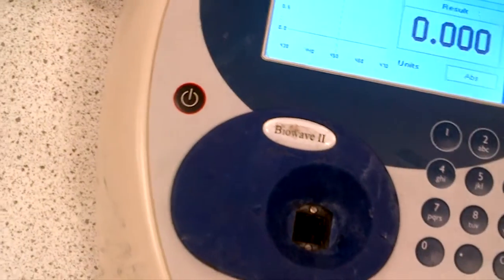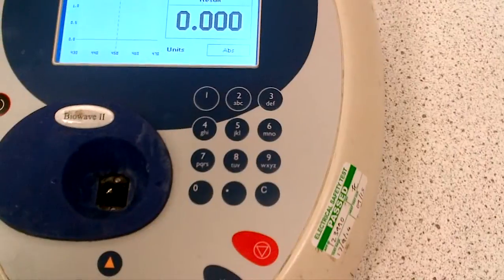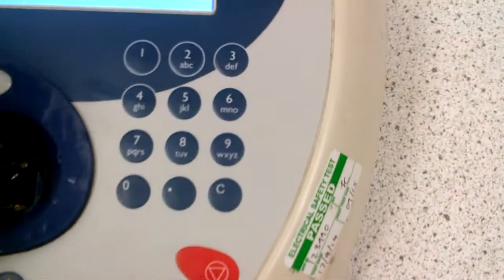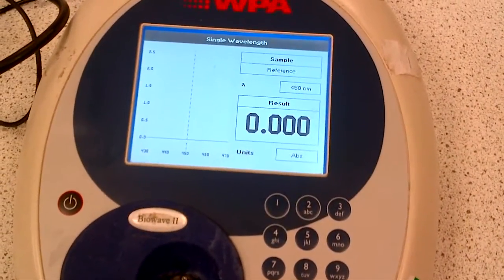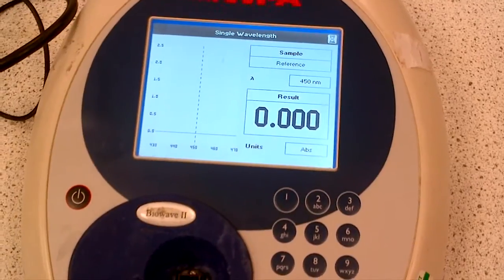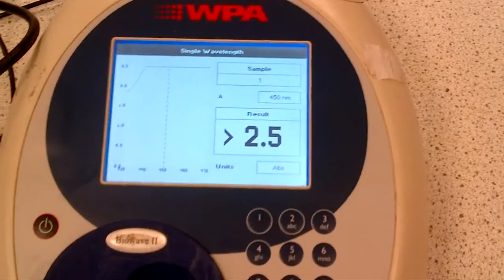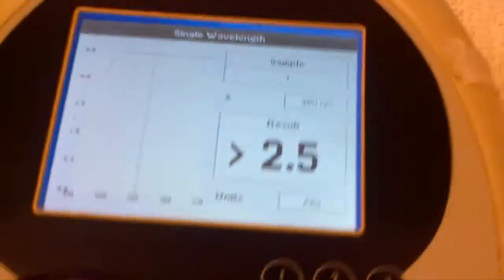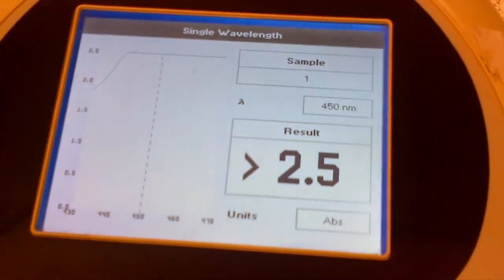Take out the cuvette, and for this one I've got some permanganate solution made up, so we've got a fresh cuvette of permanganate. We will put the permanganate into the cell, and this time we need to press the green functional key on the UV to collect. And we get a reading above 2.5, so this says to us that the permanganate is possibly too concentrated, so you should obviously at that point dilute down.